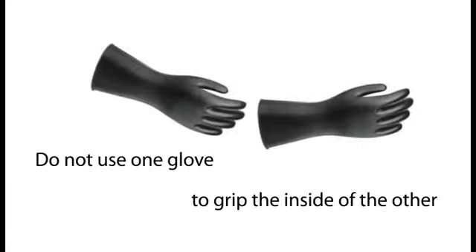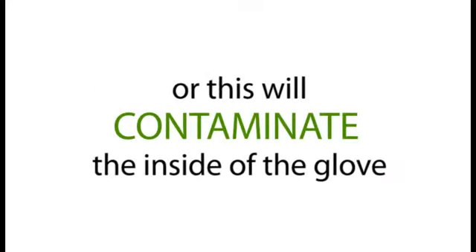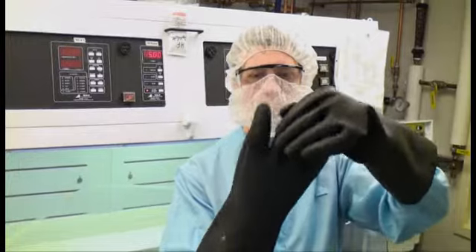When you are finished with the gloves, thoroughly clean them off in the glove wash before removing them. Do not use one glove to grip the inside of the other when taking them off, or this will contaminate the inside of the glove. Instead, take them off by pulling on the fingers.